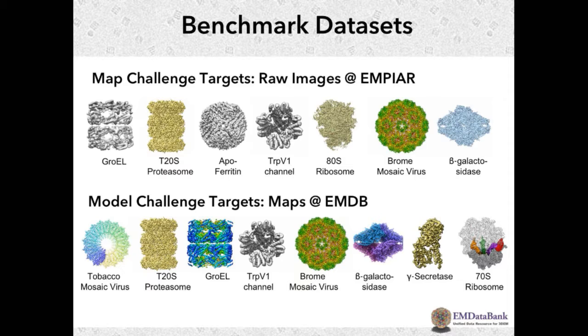For the model challenge targets, that was a little easier because we had the maps at EMDB, so every single one of these is a map that is available in EMDB. The only thing was we went back to the depositor and said, could you give us the half maps, the independent half maps, so that our challengers could use them to help if they wanted to for their modeling.